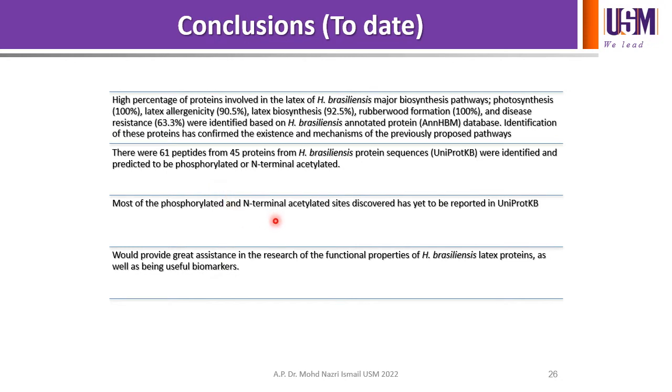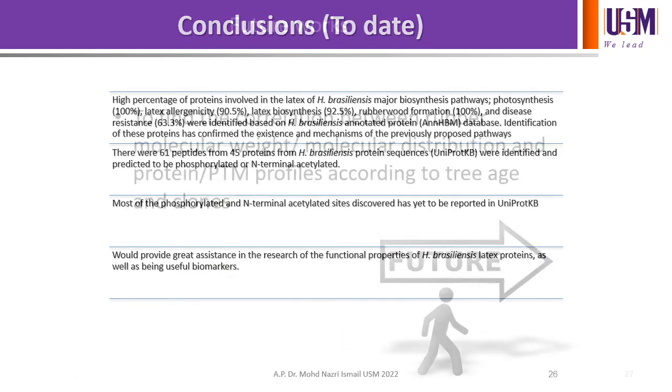Most of the phosphorylated and N-terminal acetylated sites discovered have yet to be reported in UniProtKB. This will provide great assistance in the research of the functional properties of H. brasiliensis latex proteins, as well as being useful biomarkers.